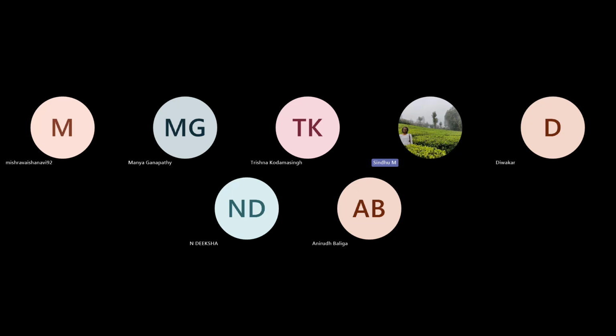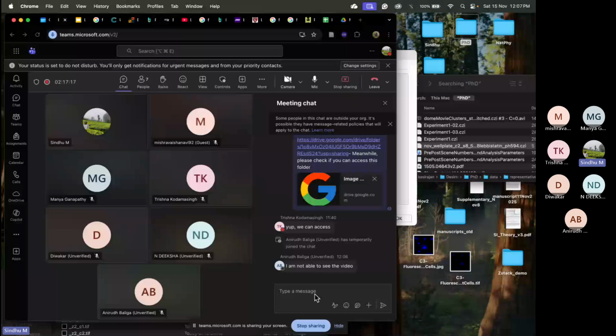This is a time-lapse image. I think this is a multi-channel image. Is it okay? Again, I wanted to open all the channels together and all the time points together. I'm sorry, the internet is bad, so it just stops sharing on its own.